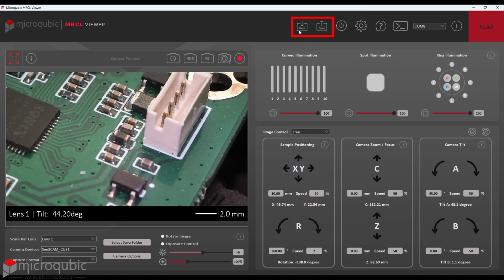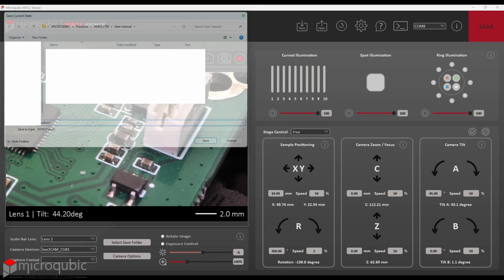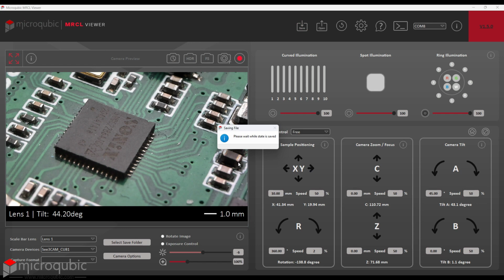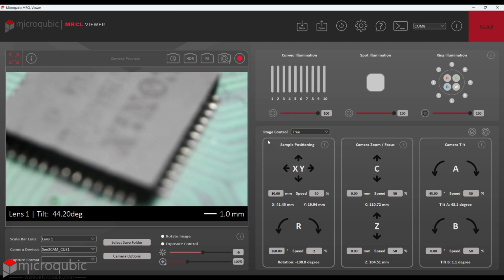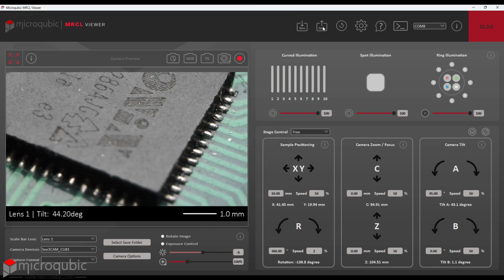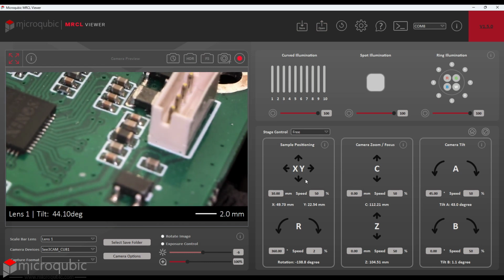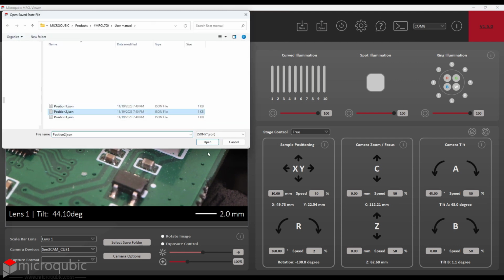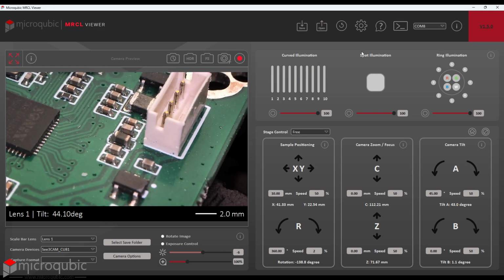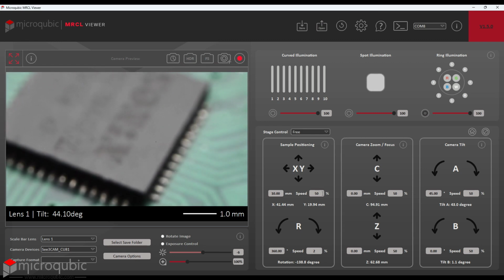All these illumination parameters and actuator positions can be saved in a JSON file, so that particular imaging configuration can be recalled later. You can save different positions, tilting angles, and zoom levels using the Save button on the top. Then you can recall that configuration using the Open button. For example, you can go back and forth between two locations on the chip during an experiment. You can also save a video while the microscope travels from one position to another, or while the illumination changes.